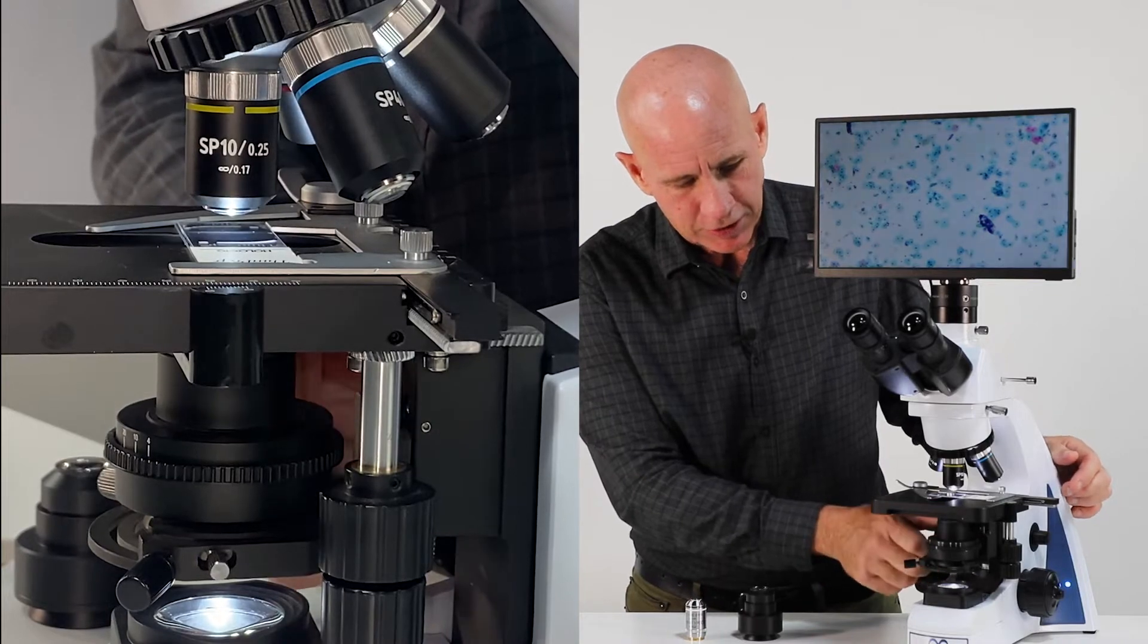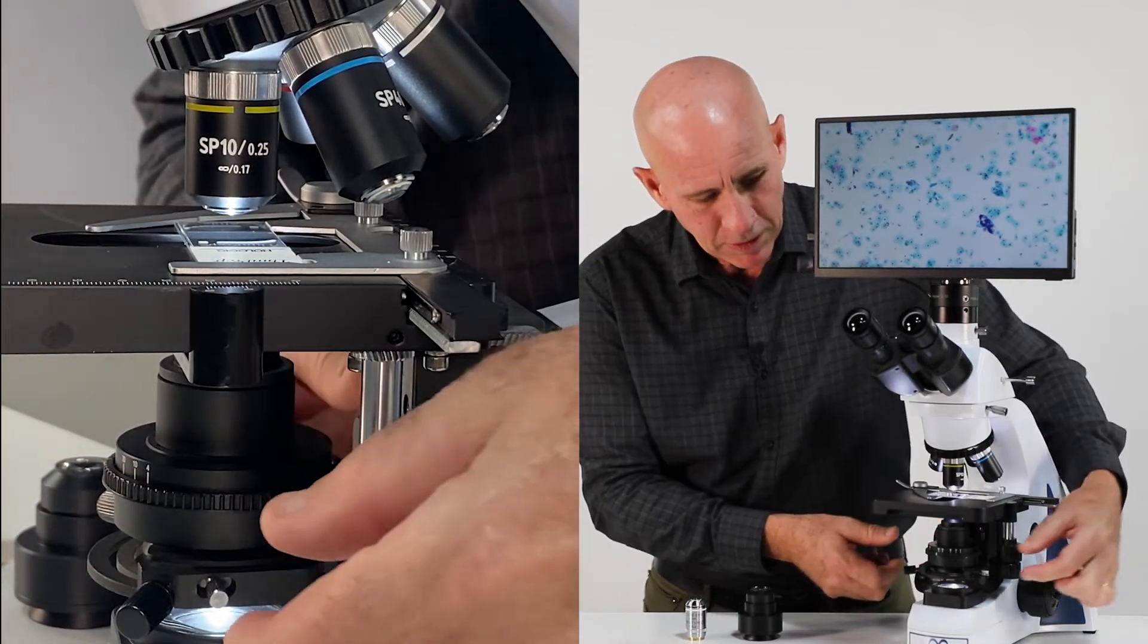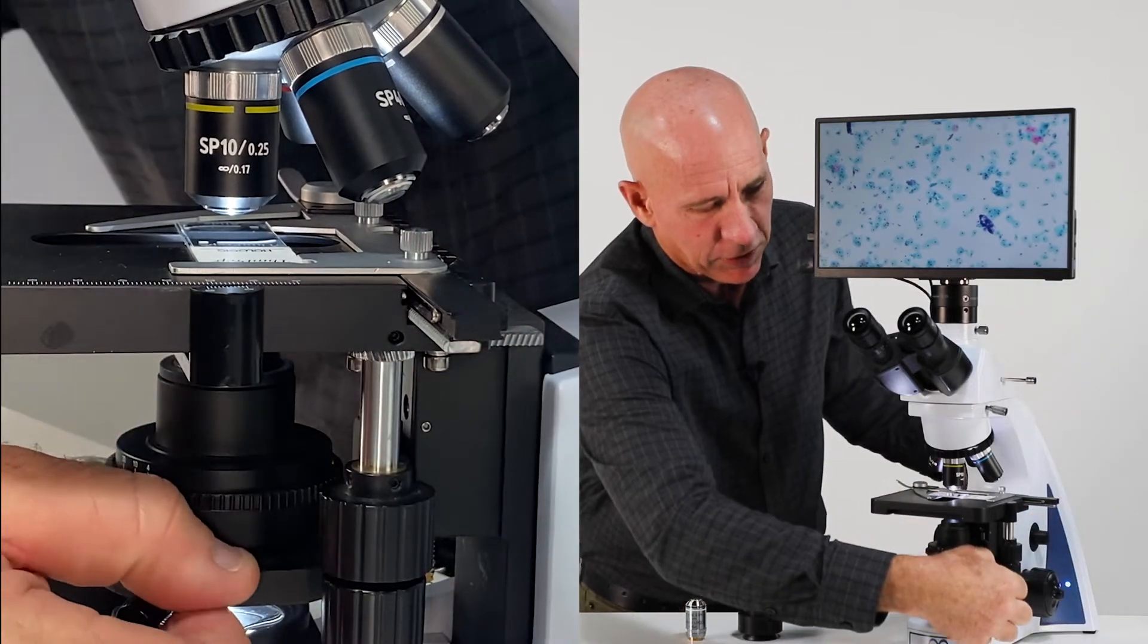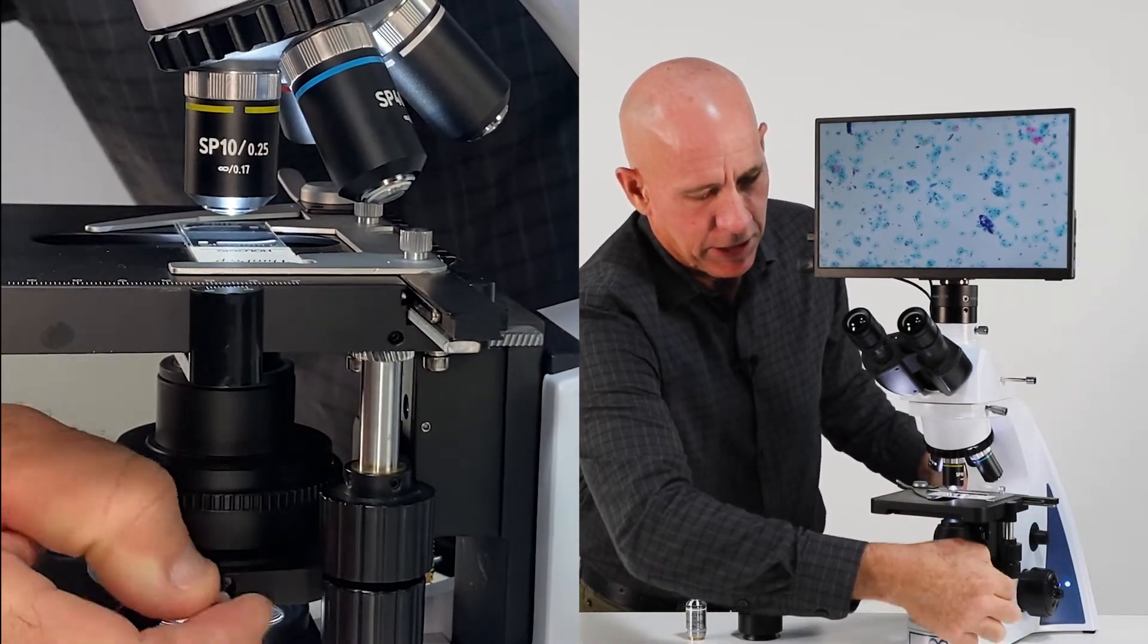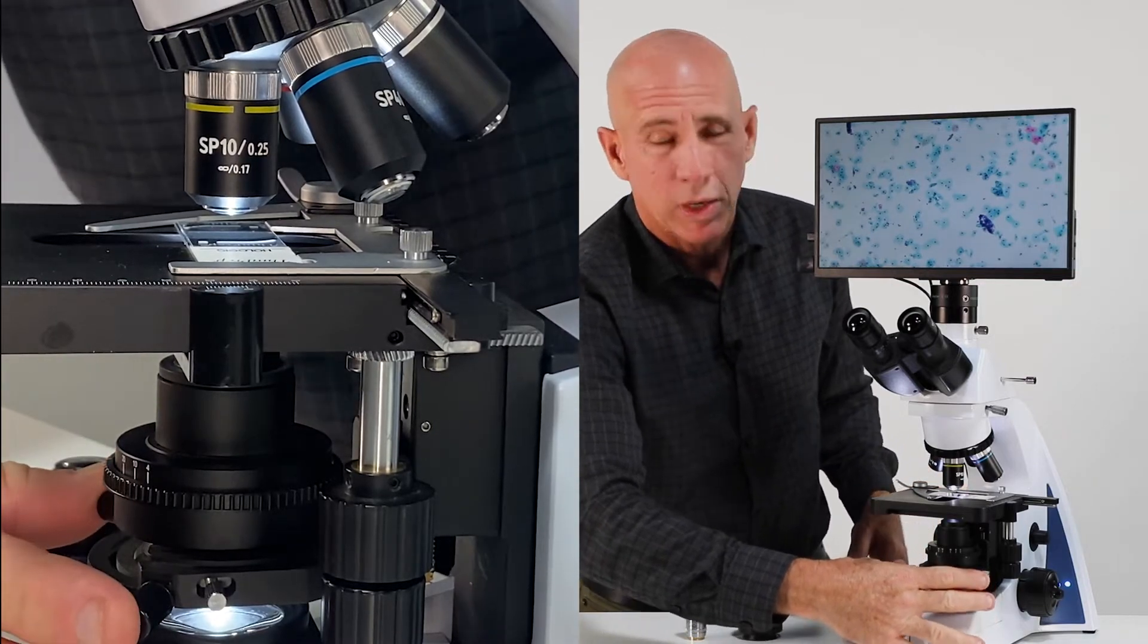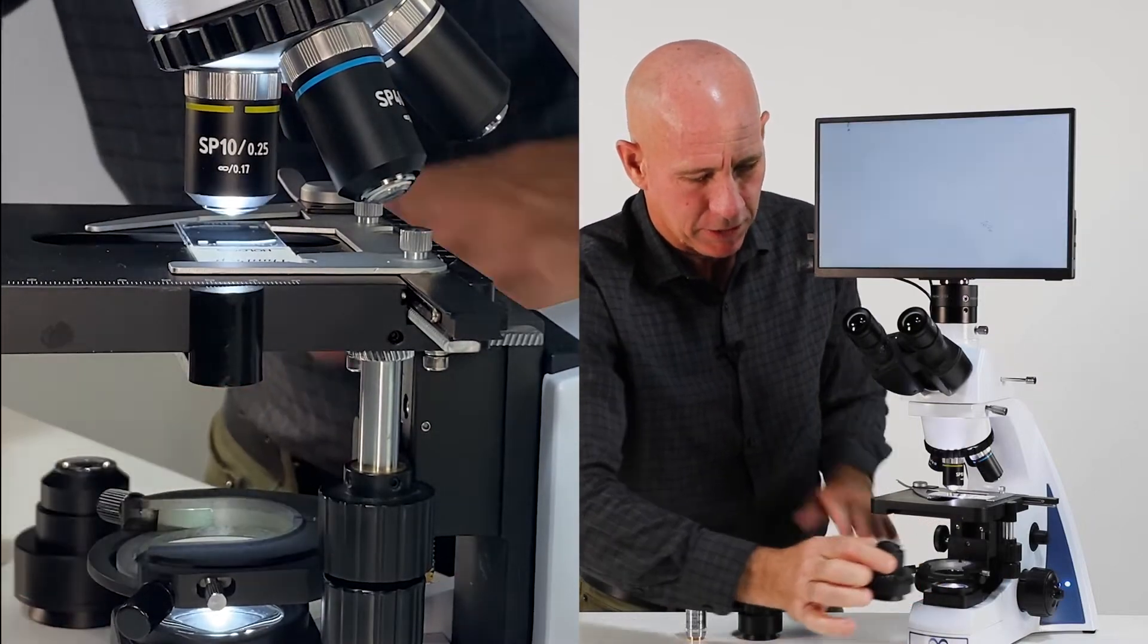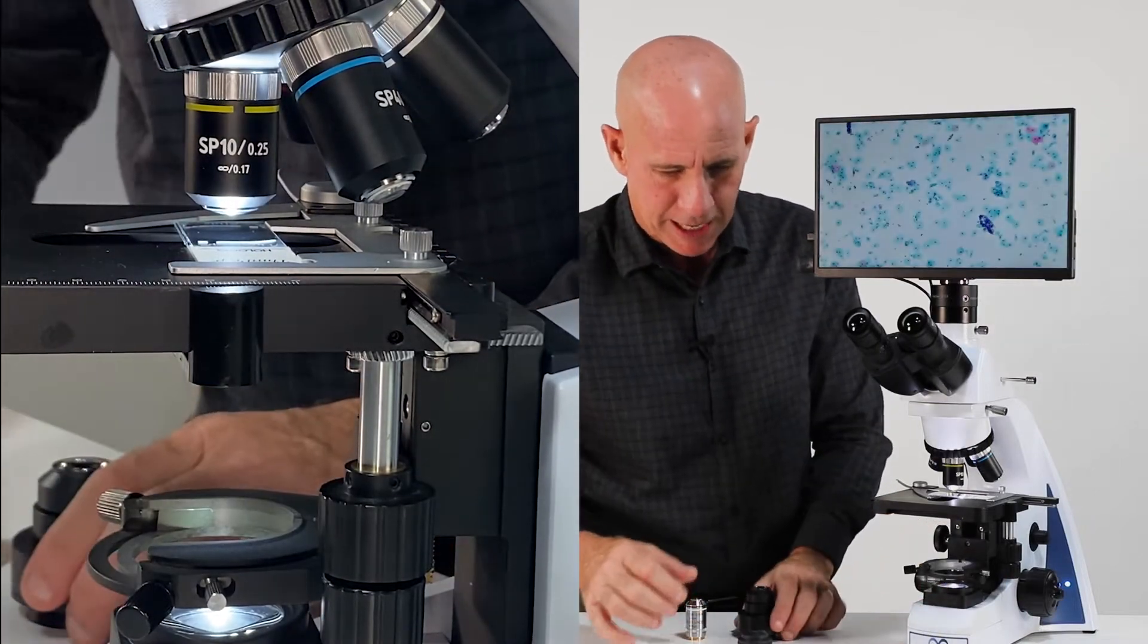So to change over to dark field, first you have to lower the condenser, then you're going to loosen this silver thumb screw that's right here. Don't change the alignment, we'll assume that your condenser is already aligned, but we loosen the silver thumb screw and we can now pull it out. As long as it's lower, it comes out.